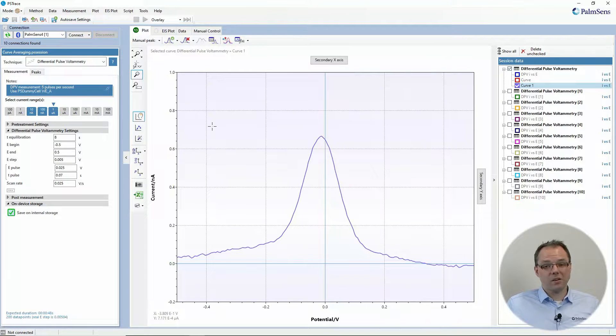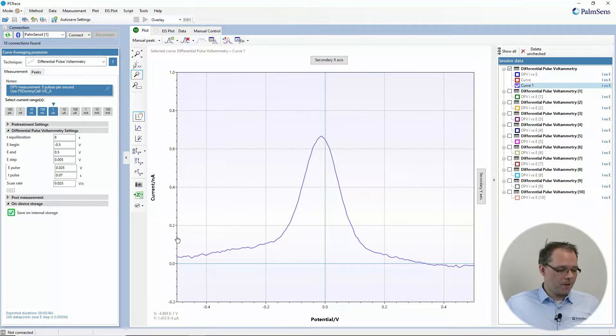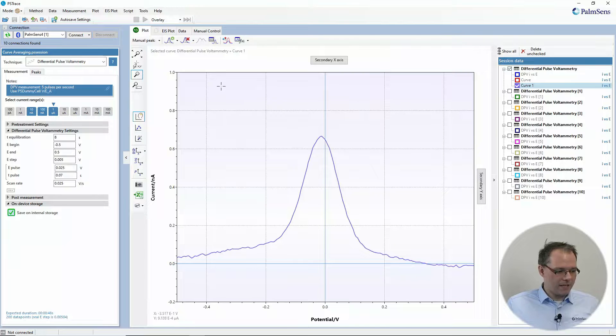And you see it's a lot smoother than the other ones. Well, but it doesn't have a nice baseline.